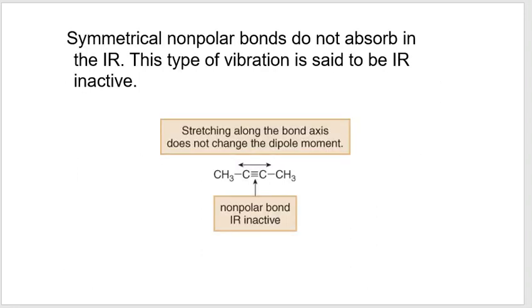On the other side of that, it is possible to have molecules that are missing bands, and that could be because it's a symmetric stretch. That is an inactive IR vibration. You still will have other vibrations that are visible, so it will just be missing one. Carbon dioxide does that too.